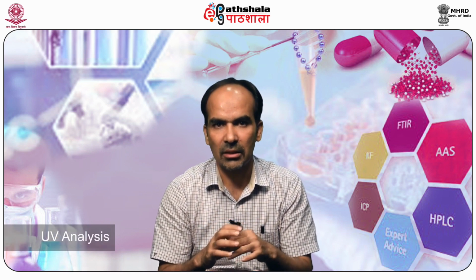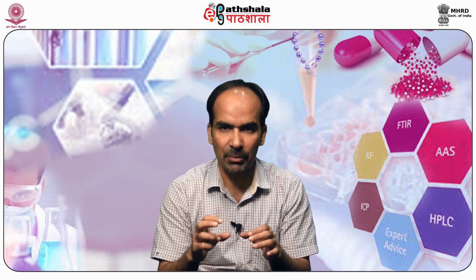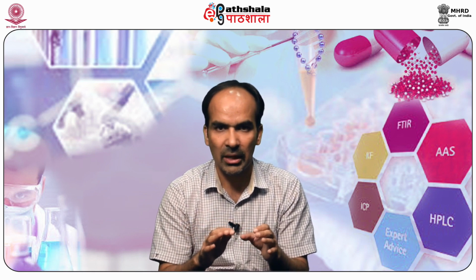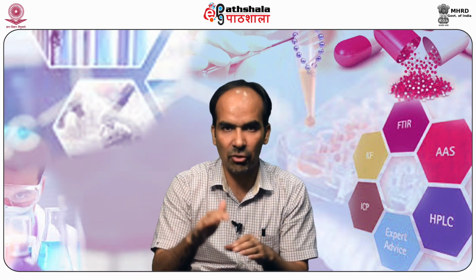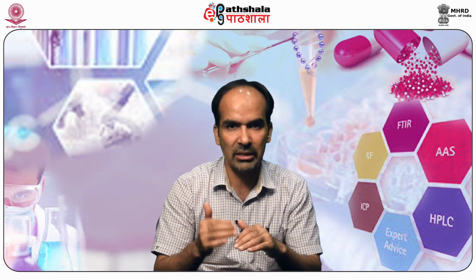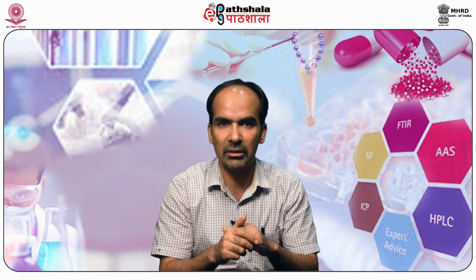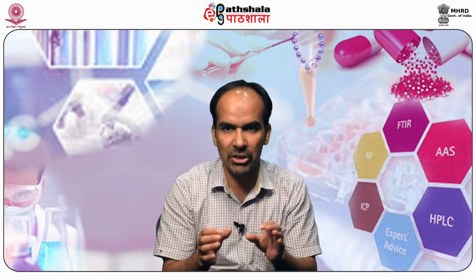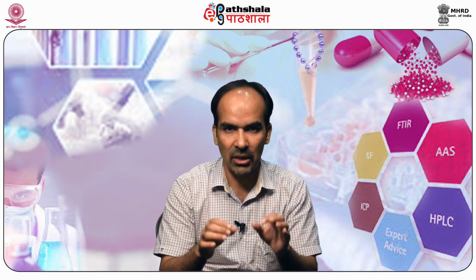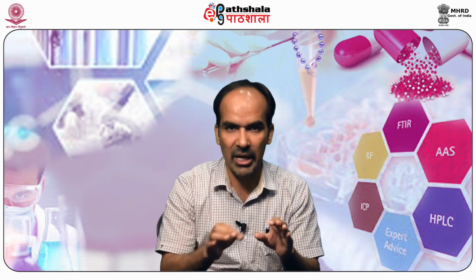So in UV analysis, we understand that the energy that is used for recording the UV spectra, UV absorption, is strong enough to bring about electronic changes. So this means that when a UV light is put on a sample, there is excitation. So the electrons travel from lower energy level to the higher energy level. So they are also associated with smaller changes related to vibrational and rotational changes. So this is the reason in a UV analysis, when you record a UV spectrum, you get a banded spectrum rather than a line spectrum.